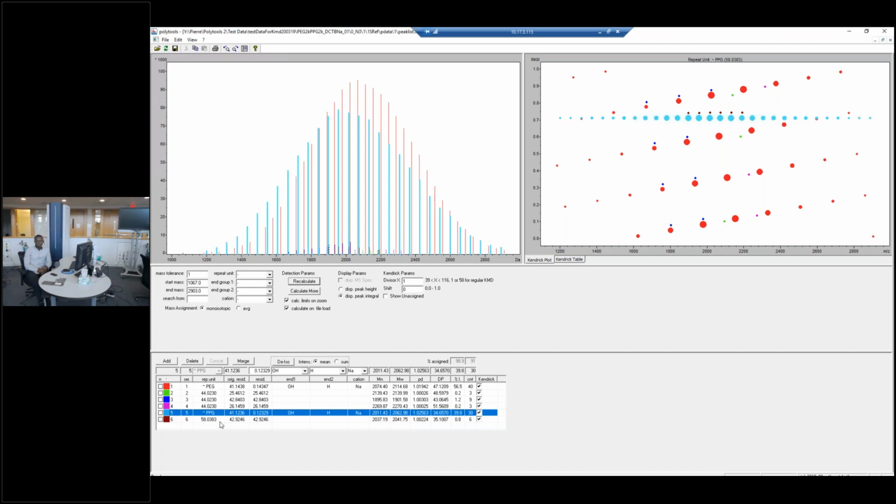Next question. How to make a matrix choice for polymer sample, and at what ratio we should add it with the sample? Good question. So especially for polymers, there's no proven one matrix for one type of polymer that is available. Usually, you have to do a little bit of research and see if anyone has analyzed the same polymer, especially if it's a synthetic polymer that has never been analyzed before.